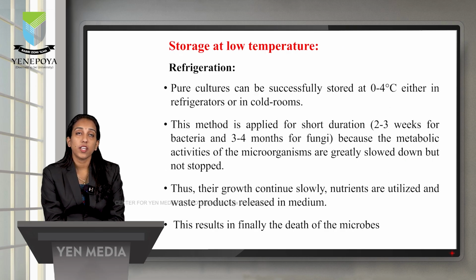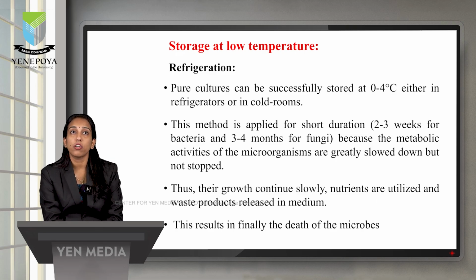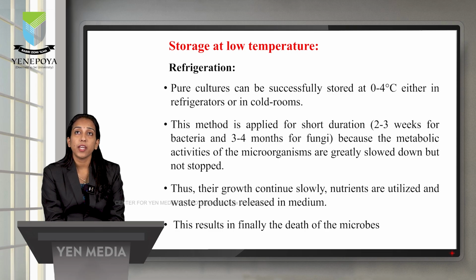Then the next one is storage at low temperature. Low temperature storage means refrigeration. As we all know, refrigeration means keeping at a temperature of almost 0 to 4 degrees Celsius in a cold room or in refrigerators. This is actually for a short duration, normally 2 to 3 weeks.